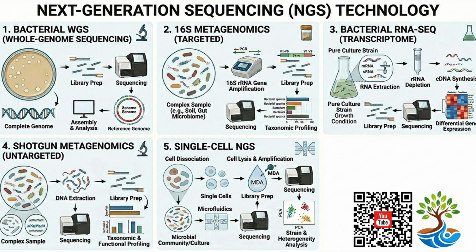While 16S sequencing provides an excellent overview of microbial community composition, it offers limited information about the functional capabilities of those microorganisms. The third technology is RNA sequencing, or RNA-Seq.